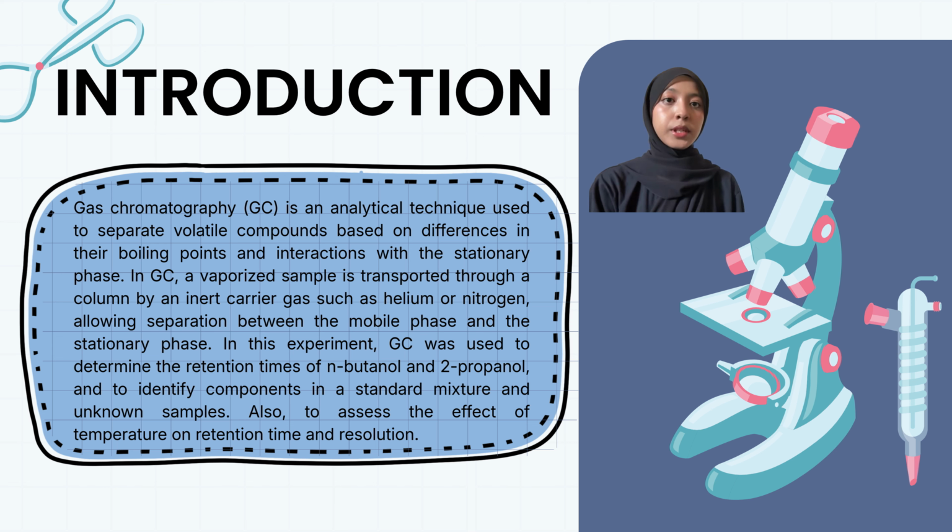In this experiment, GC was used to determine the retention times of N-butanol and 2-propanol, and to identify the components in the standard mixture and unknown sample. Also, to assess the effect of temperature on retention time and resolution.